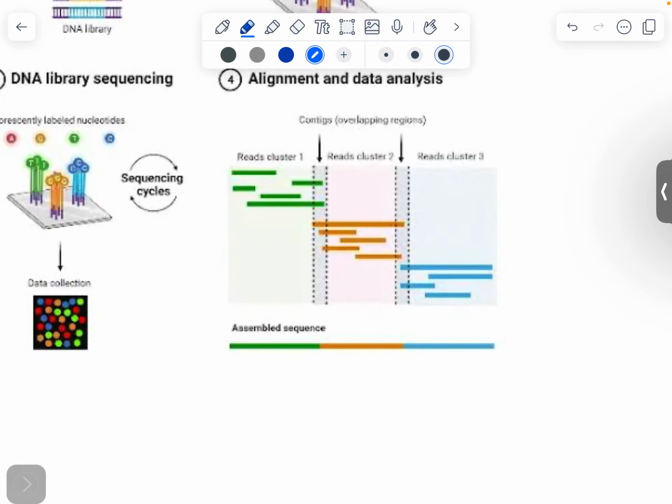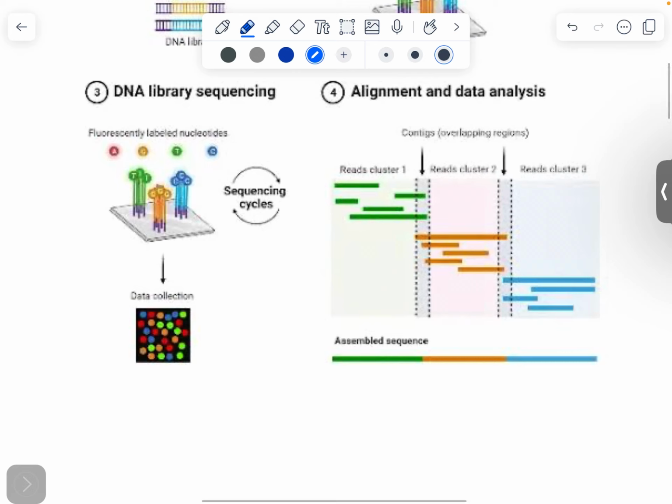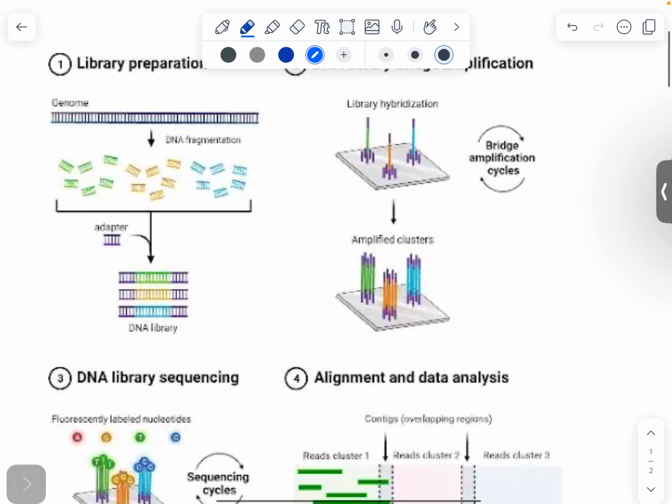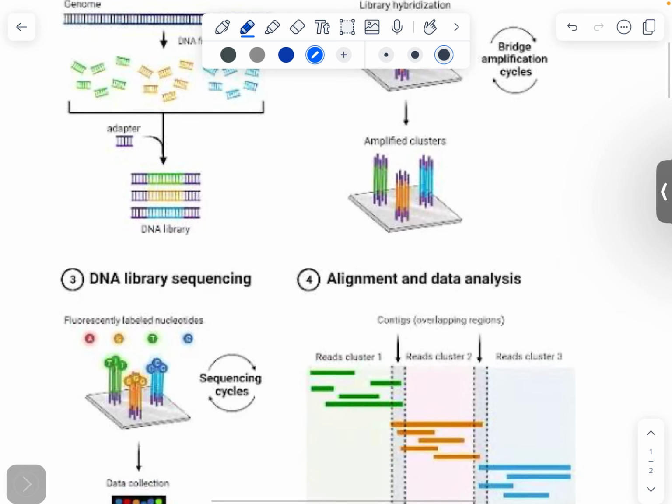When these reads are mapped to the reference genome, how could we get more reads? See, when we load this library onto the machine, the machine performs PCR amplification. That means each fragment is sequenced multiple times. Why does each fragment of DNA have to be amplified multiple times?